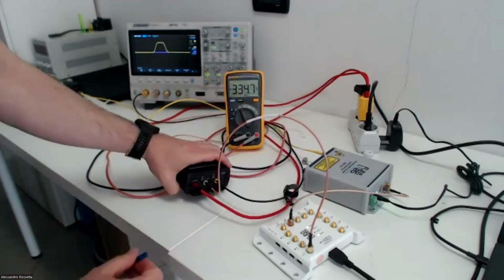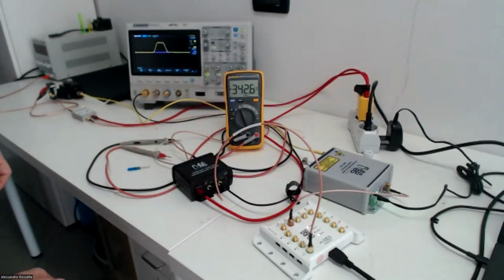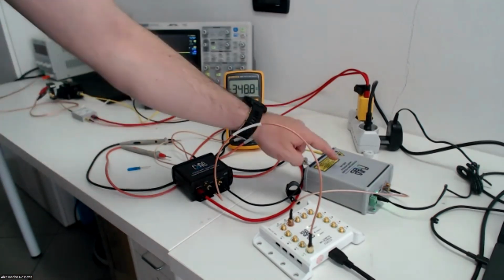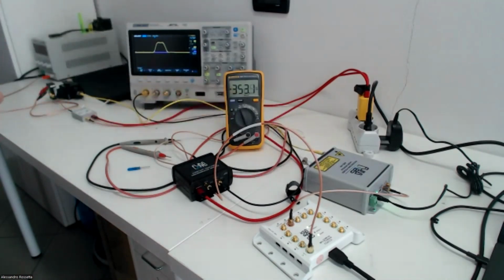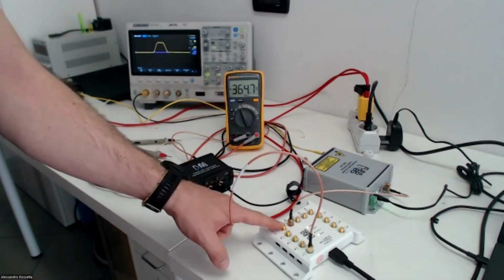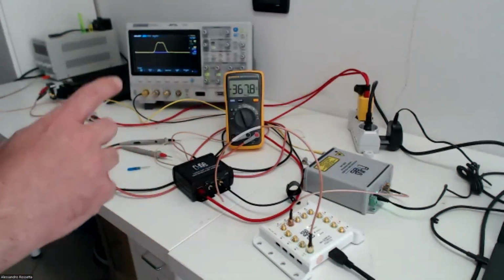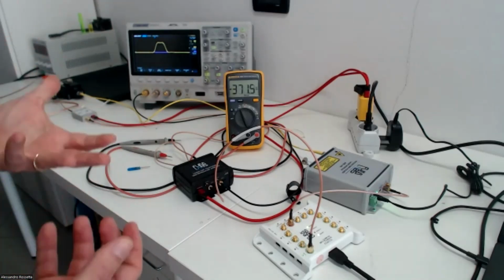So now what I would do, so the cuvette holder is connected, we have a fluorescence filter, then we have a photomultiplier tube, and we are shining a FLIMLabs 405 nanometer laser light to the cuvette. We are capturing the fluorescence with the PMT, then we have a low noise amplifier, the constant fraction discriminator, and our FLIM data acquisition card. So now I'm gonna use this setup to reconstruct an intensity decay profile of the fluorescence coming from the cuvette using the TCSPC technique.